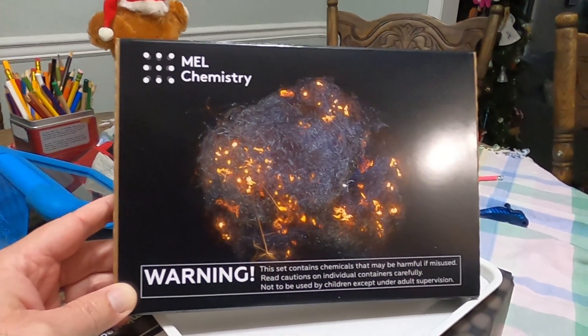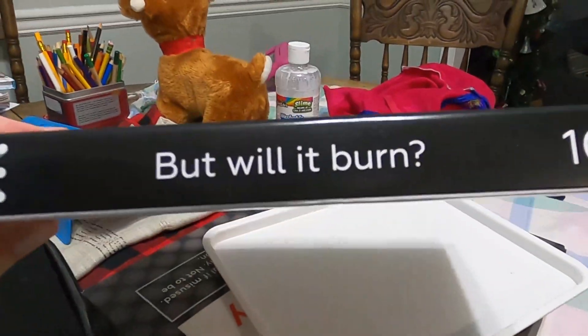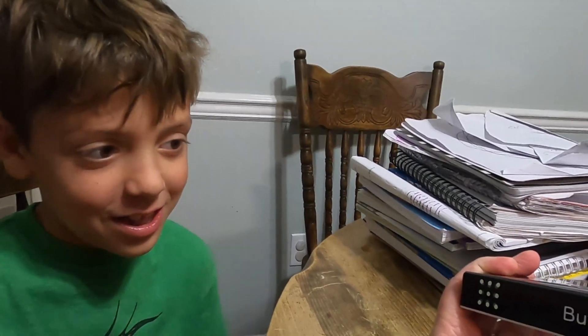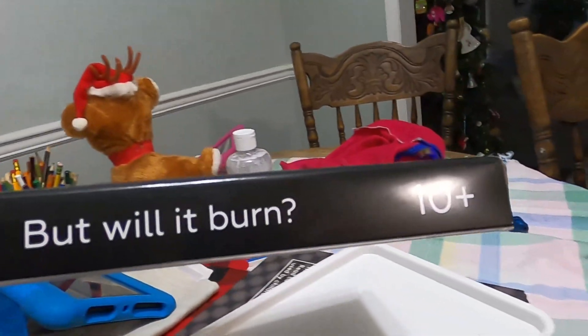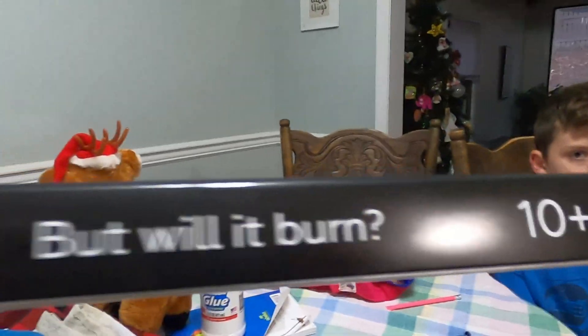Today we have another Mel Chemistry set that came in, and this one says — what's it say, Ryan? 'But will it burn?' This one's 10 plus. Are you 10 plus? Yeah. Does that mean level 10 plus? I guess it means level 10 plus — not 10 years old, right?